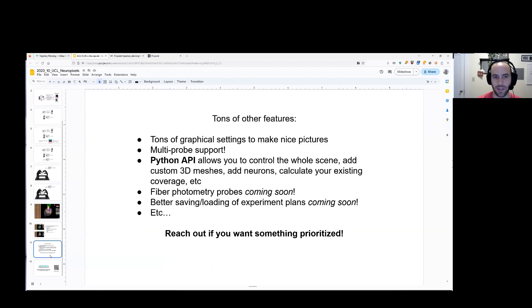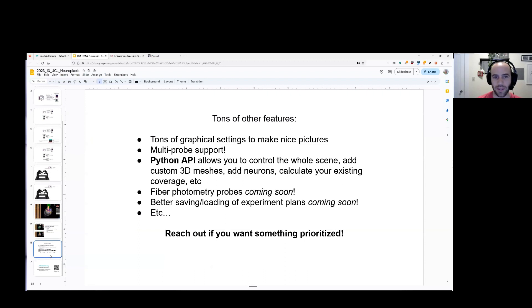Cool. Lots more stuff coming. There's a Python API that allows you to control the Pinpoint scene separately. Fiber photometry coming soon. Saving loading of experiments, et cetera.